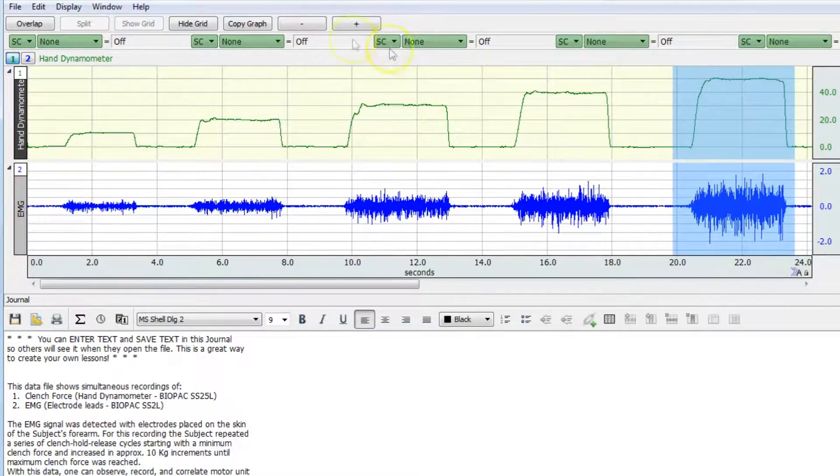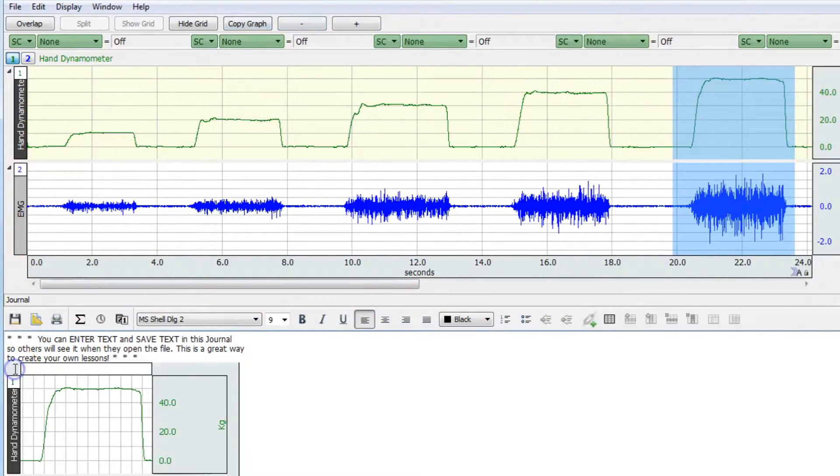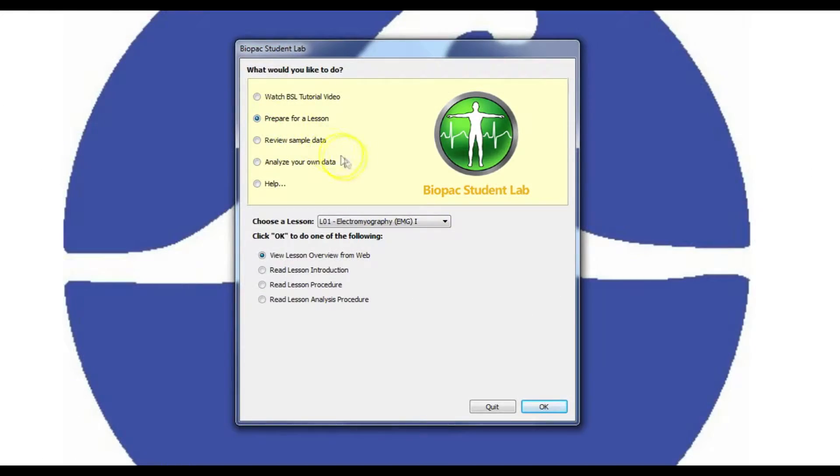Biopac Student Lab software for data recording, analysis, and sharing. Students can use the free student download to prepare and analyze data outside of class so more recording can be done in lab.